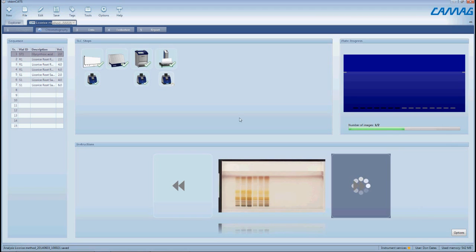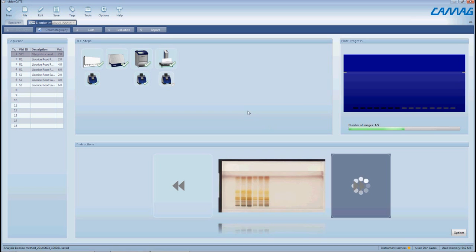But it's also critical to get that previous image acquisition because you may have some information on the plate that is shown prior to derivatization, and once you derivatize that plate you can no longer get that information but you get new information. So it's a nice feature to be able to acquire multiple sets of images.